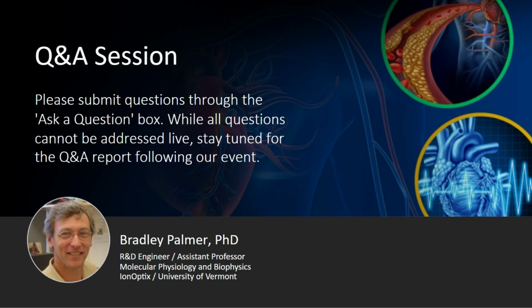And I didn't go through too much detail here, but you've got to be careful. The first 2 or 3 slices will have an awful lot of endocardium undulations and discontinuities. So the first 2 or 3 slices are almost always unusable. And it's only after you get past the endocardium do you start making these really useful cardiac slices. And of those, like I said, it's 5 to 10 for a rat and 2 to 4 for a mouse. Okay, that's great. That makes a lot of sense.